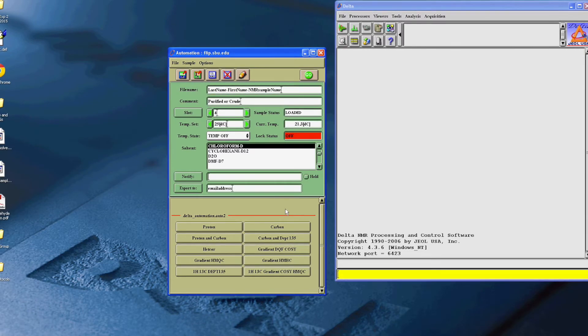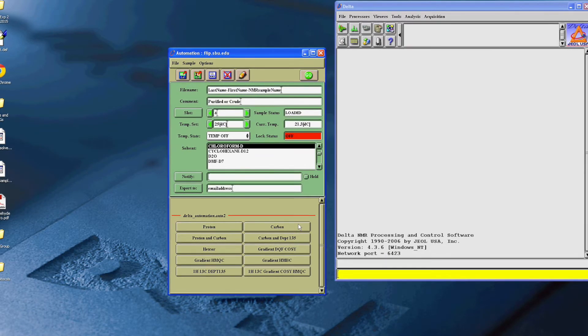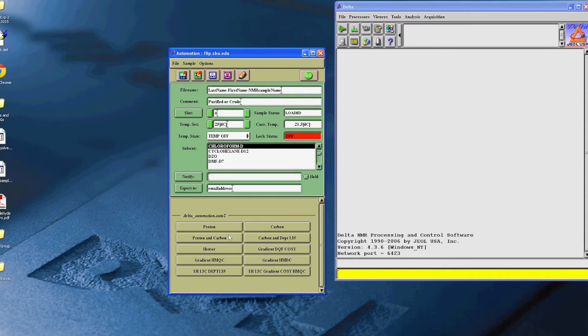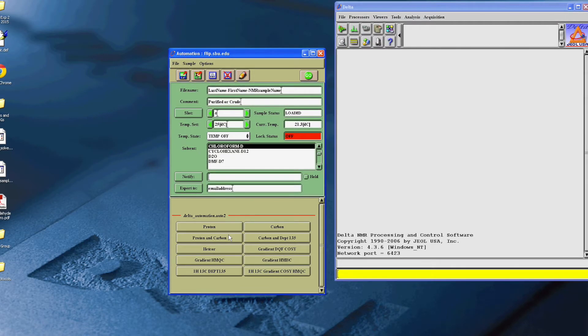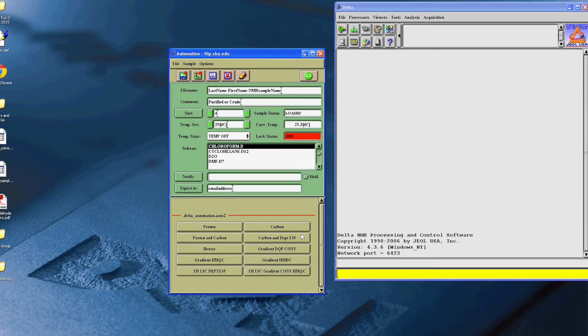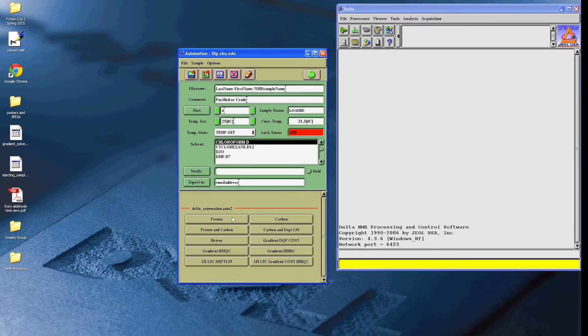Now, at the bottom, here are the choices for which type of NMR you can run: Proton, Carbon, Proton and Carbon, and Carbon and DEPT 135. Click on the one that you desire.